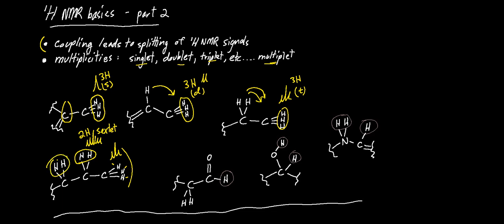And then these two protons here would be a triplet because two hydrogen signals split 2 additional times. When you're determining the splitting on a neighbor, you treat each proton as an individual. When you're determining the splitting of those same protons themselves, you treat them as equivalent, if they're equivalent.